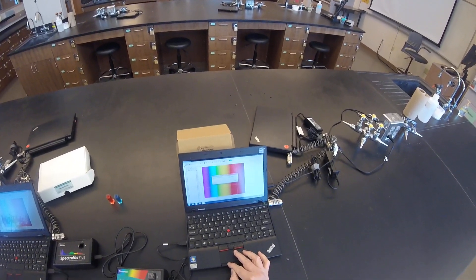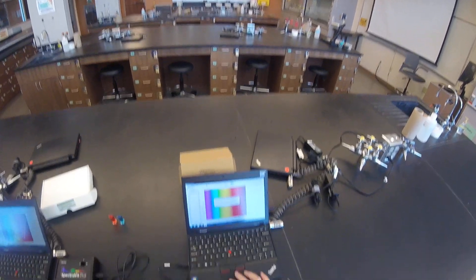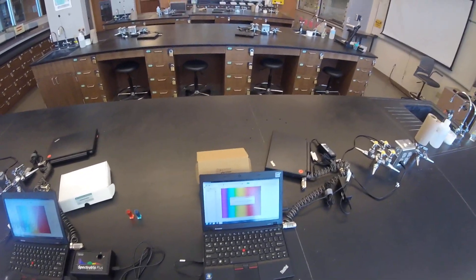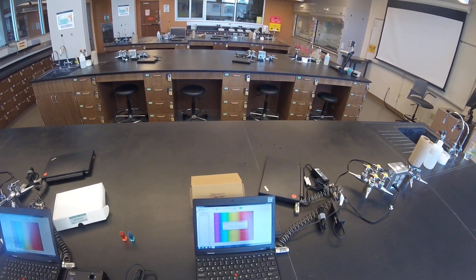Again, in your case, do not click Skip Warm Up. Let it have that one and a half minute warm up time. Again, we'll finish the calibration with my blank sitting in the SpectraVis Plus. And we'll click OK.